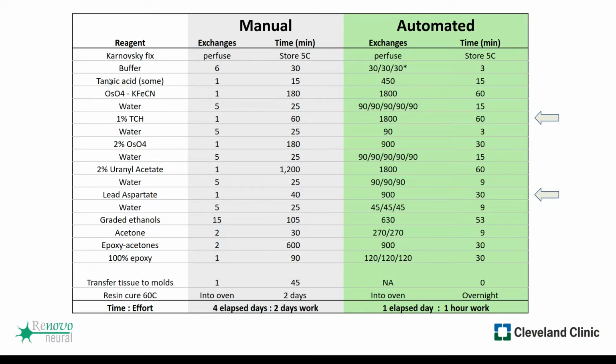Although we rarely use tannic acid, we just wanted to try out this capability. So with a couple of tissues, we had them go through tannic, while others were just in the buffer at the same time, because in your 96 well plate, you can have a row that maybe has 2 wells with tannic, and maybe that's lined up with the capsules that are number 1 and 2, and then the others in that row would just be getting buffer at that time.